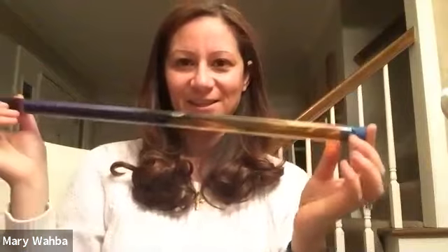And you can kind of see all the colors of the rainbow. It's pretty cool. So again, where it's green, that's neutral. Any blues or purples are basic, and any oranges, yellows, or reds are acidic. So it looks like I added a little bit more base than I did acid here, but you can see it's turning all kinds of pretty colors.